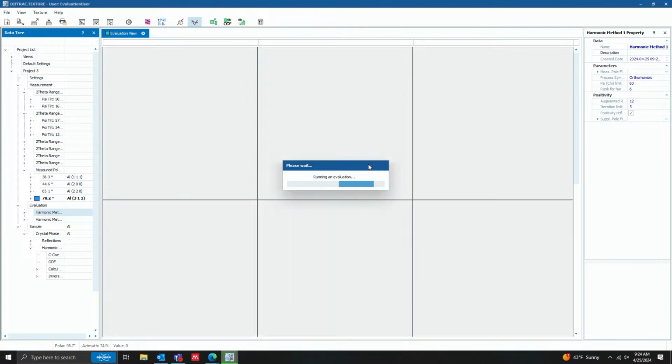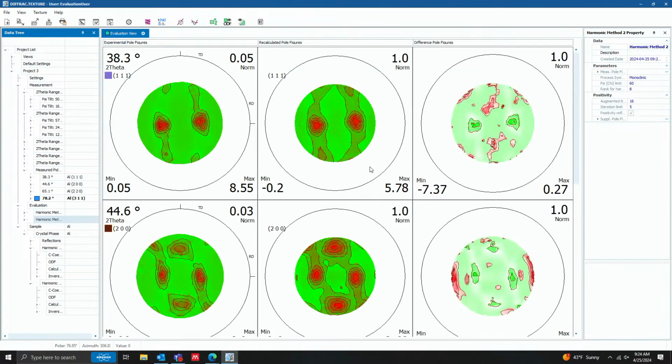Yeah, so two things to think about here. Number one, if you set the rank too high, you can fit anything anyway. Right? And I don't care what kind of fitting you're doing. If you're doing Rietveld, if you're doing this, you turn on enough stuff, it will give you a beautiful fit. That's right, and the issue with overfitting can be just noisiness in the data too. So I always start out a little bit more conservative and then work my way up. Yep. And are you fitting the true reality? Right, exactly. Occam's razor, the simplest approach is the best.